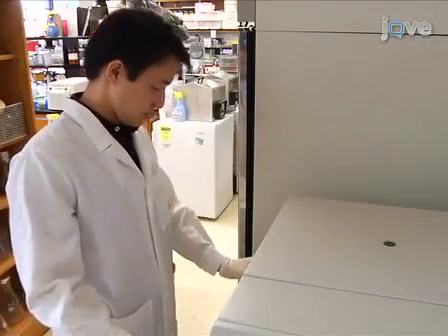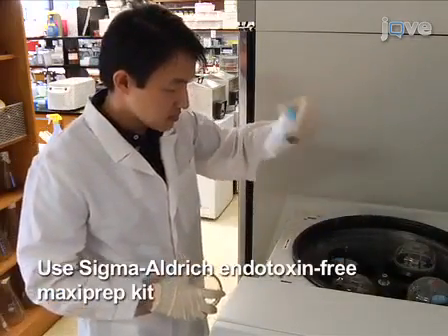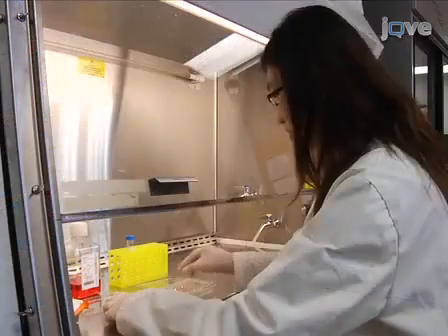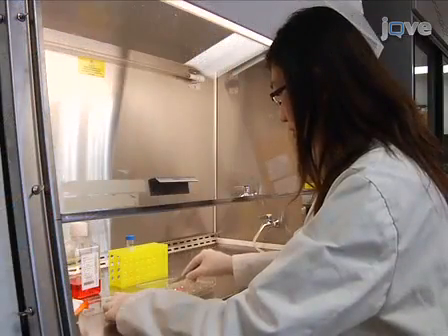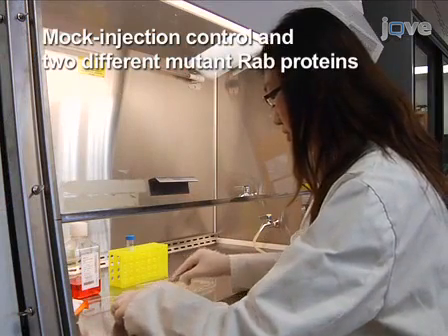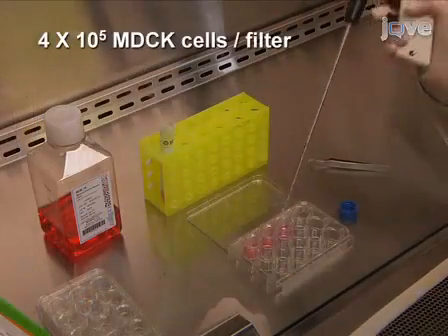Isolate endotoxin-free plasmid DNA with a Sigma Aldrich endotoxin-free MaxiPrep kit according to the manufacturer's protocol. For this experiment, use 3 clear 12 mm transwell filters of 0.4 micrometer pore size to culture the cells. Seed 4 × 10⁵ MDCK cells onto each filter.